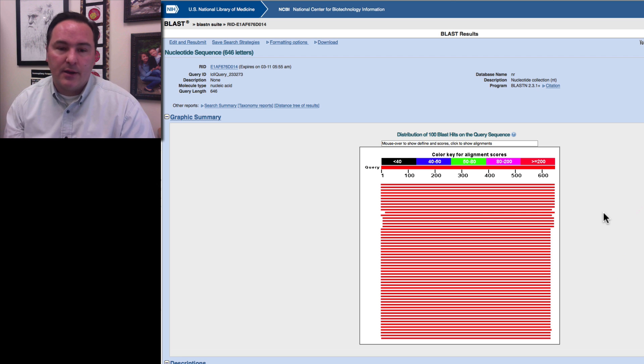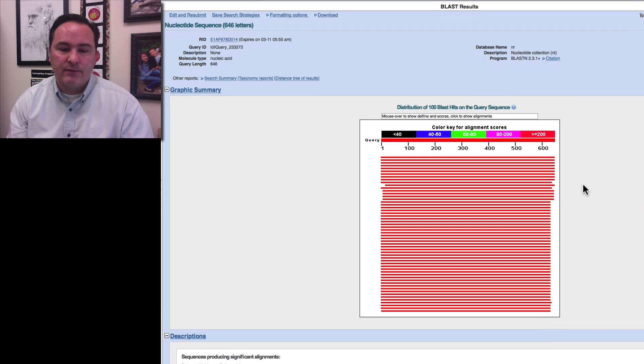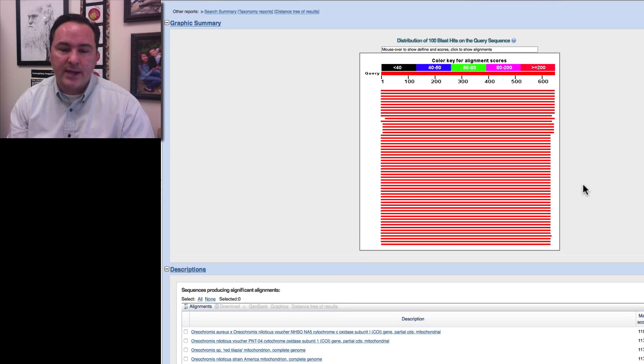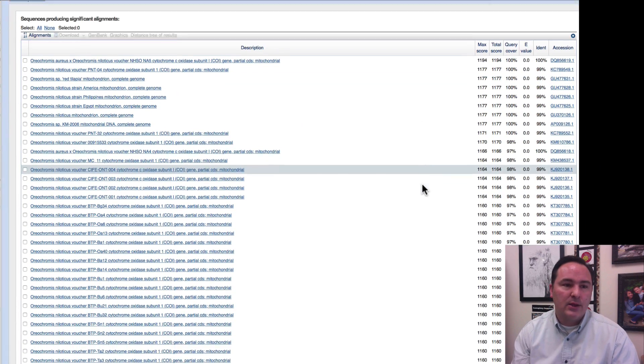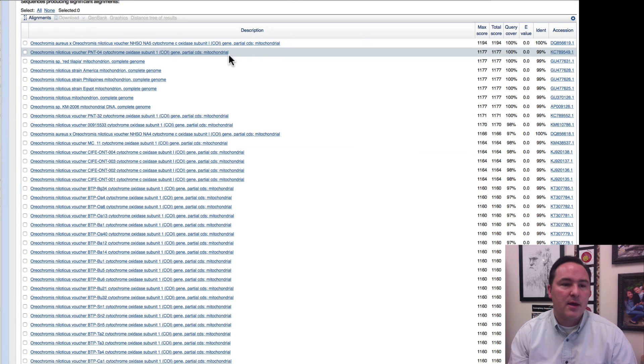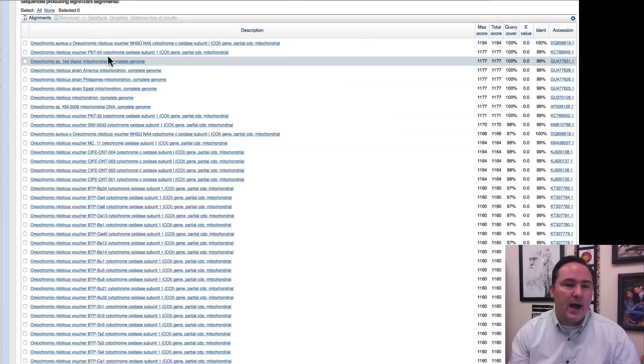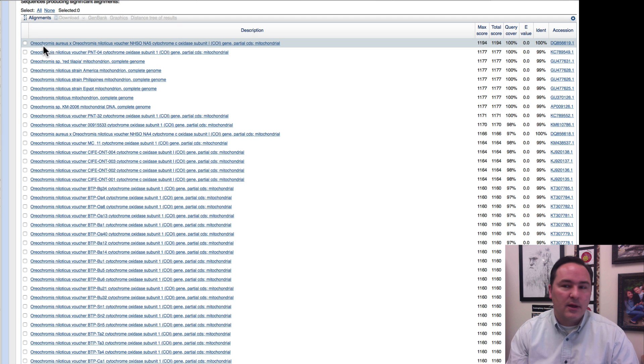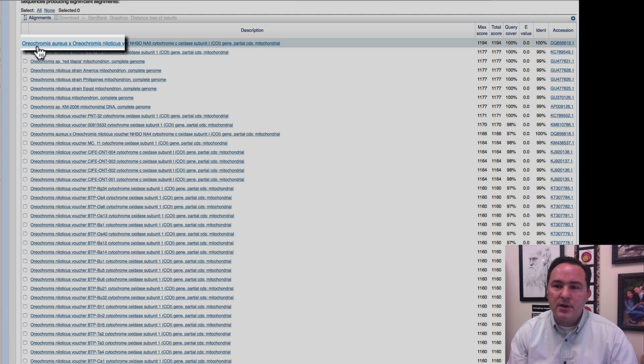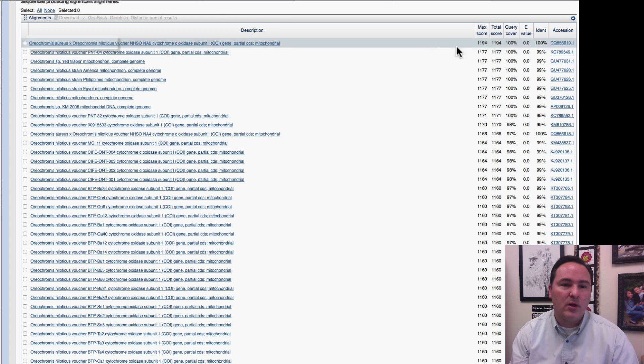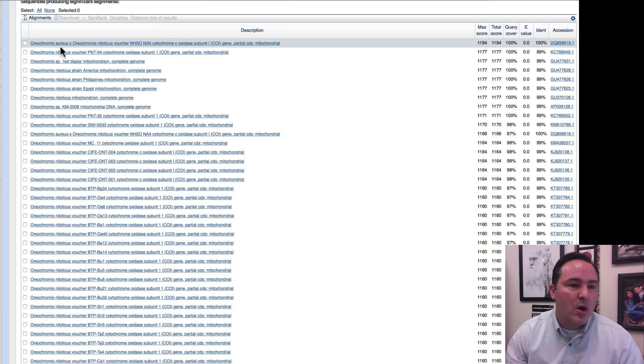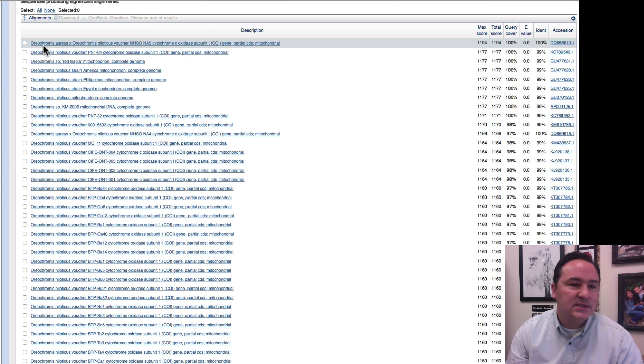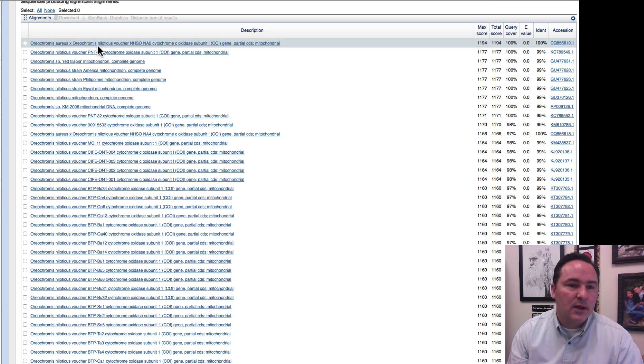And so, it's now done, once you get this screen view, it's done, and I can scroll down, and I can look and say, okay, I am looking at the most similar DNA, and in fact, it was 100% identical, was coming from Oreochromus aureus, and then it has an X, Oreochromus niloticus.